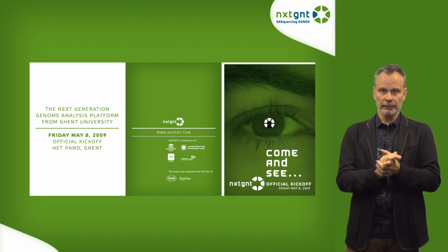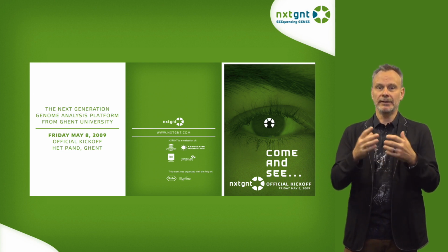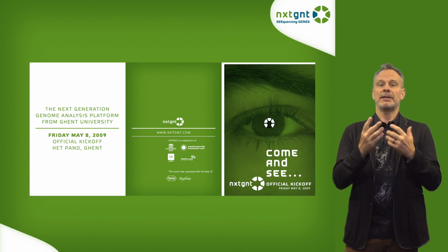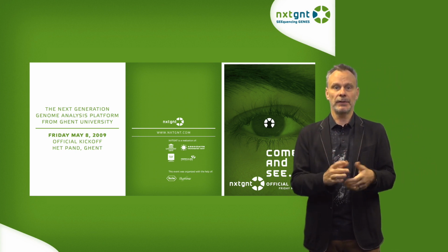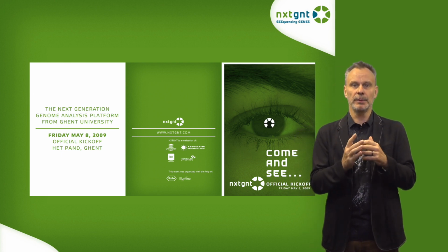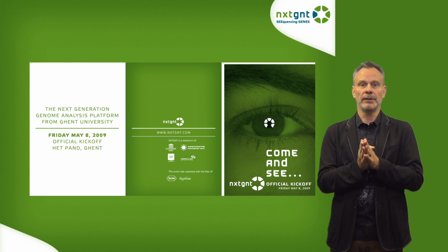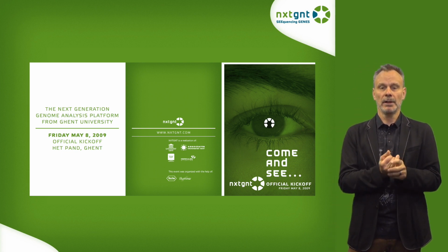The primary goals of NXTGNT were to establish a unique sequencing platform by the integration of sequencing methods with the existing research expertise in bioinformatics, molecular diagnostics, and translational medicine. The NXTGNT team consists of a steering committee supplemented with an operational team consisting of both junior and senior researchers.